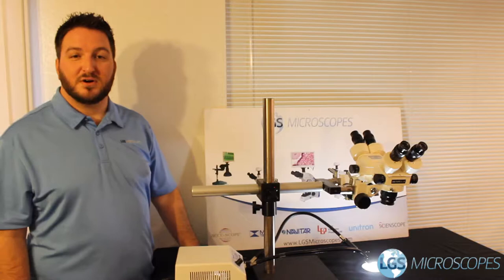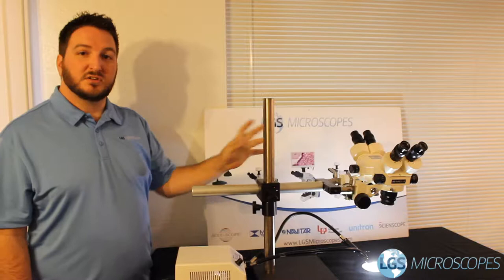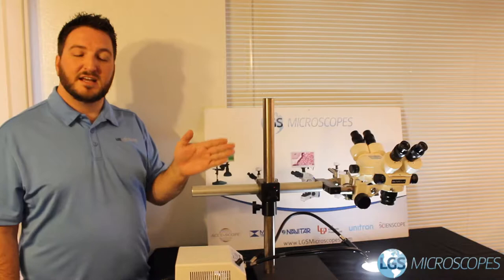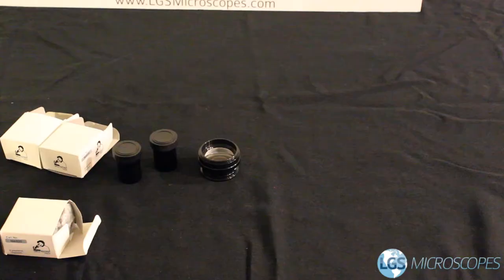Hi, welcome back to LGS Microscopes. My name is Paul and today I'm going to be showing you how to assemble and set up this dual-headed stereo microscope station. This is a great system for any time you have two people that need to be looking at or possibly manipulating the same piece at the same time. There are quite a few steps to this installation but I'm going to go through each part piece by piece and once it's all set up you should be good to go.